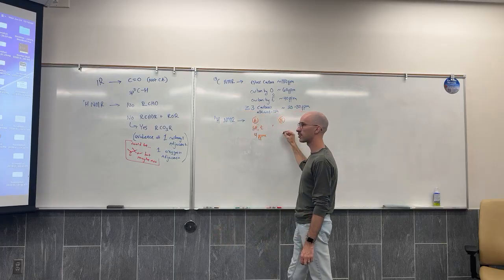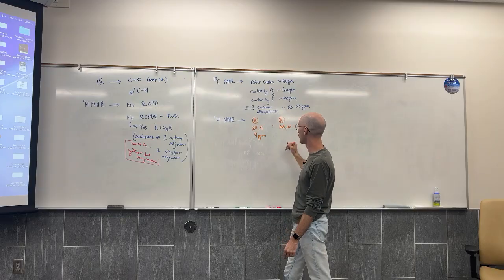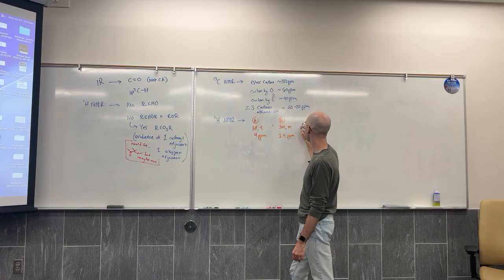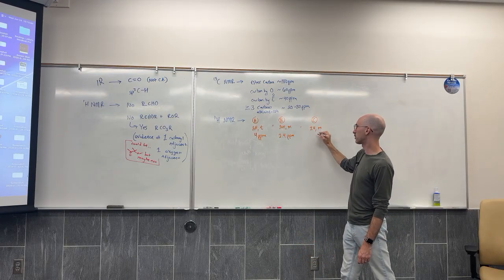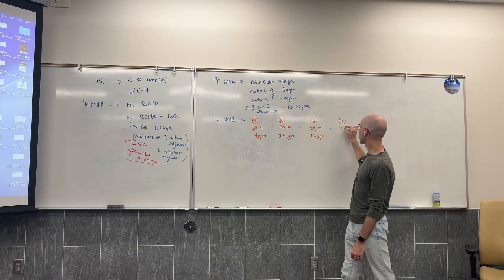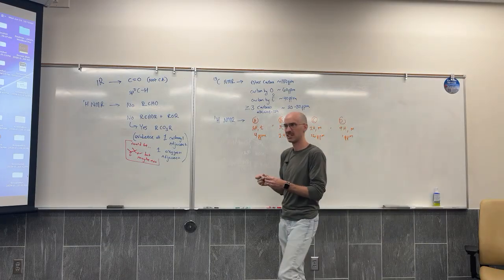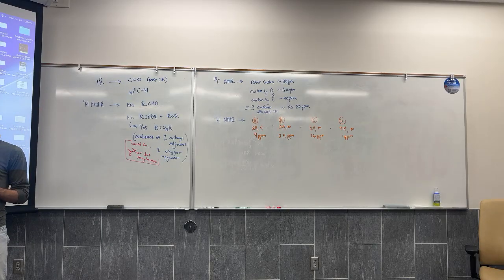B is a 2H multiplet. So I'm just going to label that as M. That's showing up around 2.4 ppm. Signal C is a 1H. This also looks like a multiplet, around 1.6 ppm. And then signal D, which is shown as 9H. But again, as we said, I think that this might actually be 2 different signals overlapping. I don't think that it's 3 CH3s identical to each other.